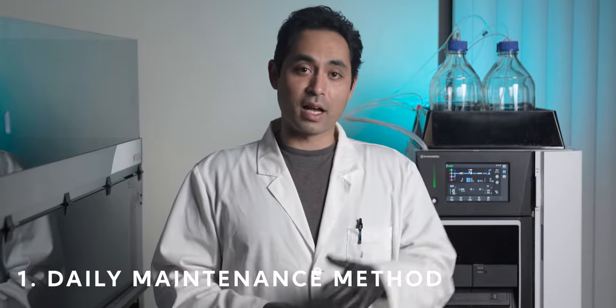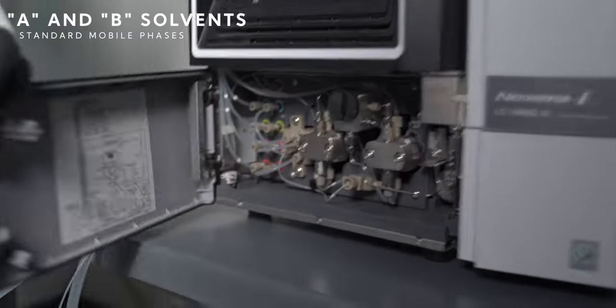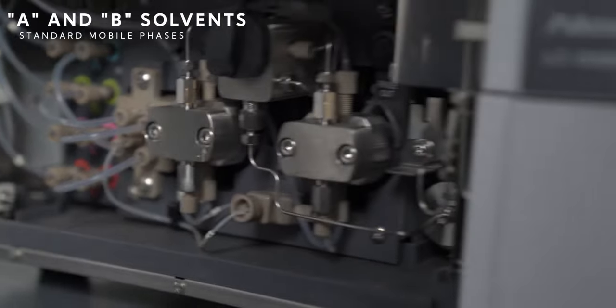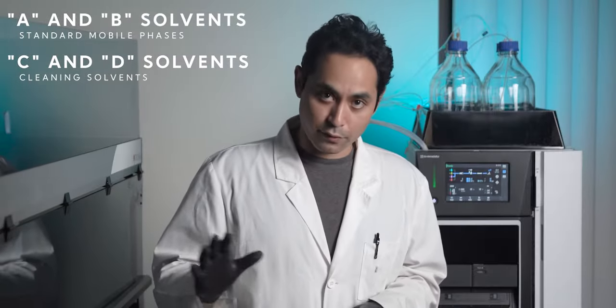The first method is your daily maintenance method. If you have a solenoid valve in your pump you can select up to four solvents. A and B solvents can be used as your standard mobile phases for regular operations. C and D then can be selected and used as solvents for cleaning. C and D would normally consist of water and some kind of organic solvent like methanol.